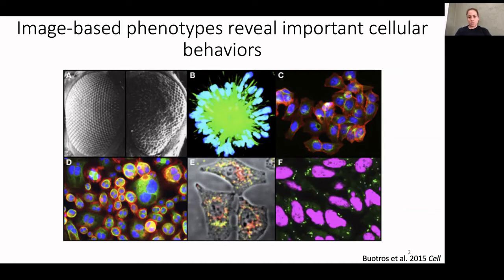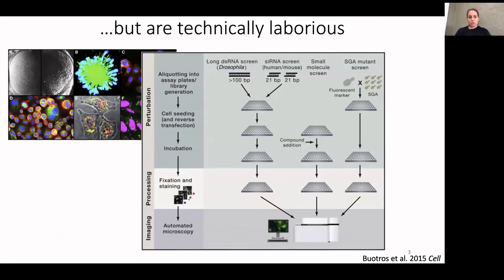And this project was really born because our PI Gene wanted to do a screen looking at what the genetic regulators are of stress granule formation and stress granule assembly. However, these functional genomic screening platforms are often really laborious and require complicated setups, the use of robotics, so that when you are performing manipulations in potentially thousands of wells with replicates, to make sure that these very small volumes are accurately pipetted, you don't have batch effects, and it's often a very complicated process.